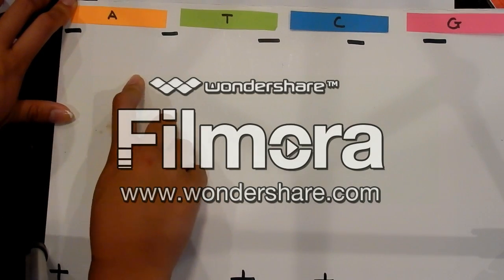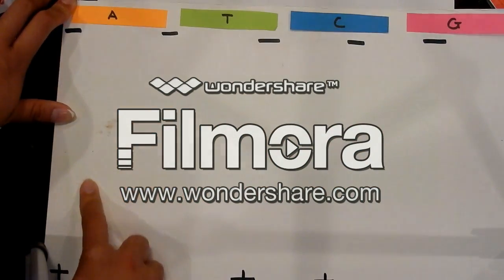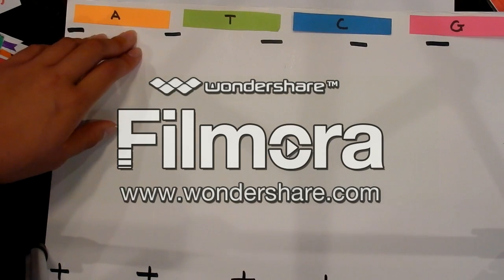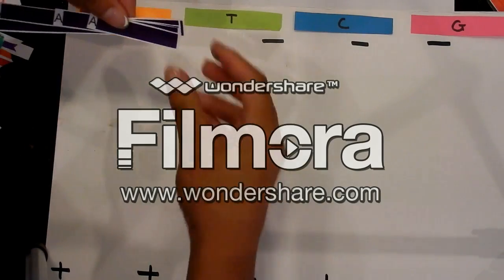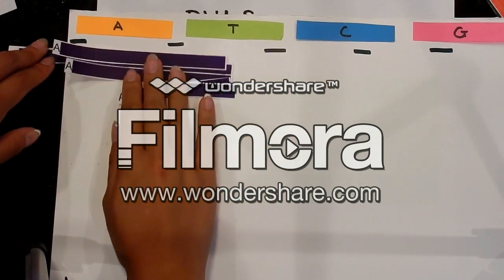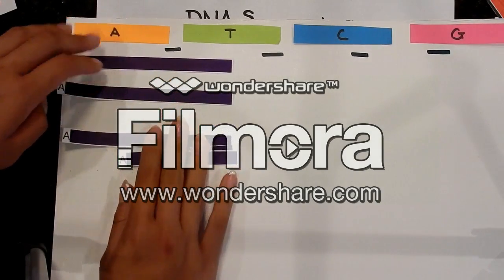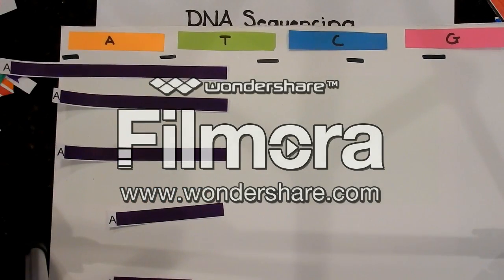The largest DNA strands will stay here and then get smaller as you go down. So, if we were testing the adenine fragments first, we place all the adenine fragments here, and then as they move down, the larger ones will stay closest to the negative side, and as the smaller ones keep going down, the smallest will hit the very end of the electric field.